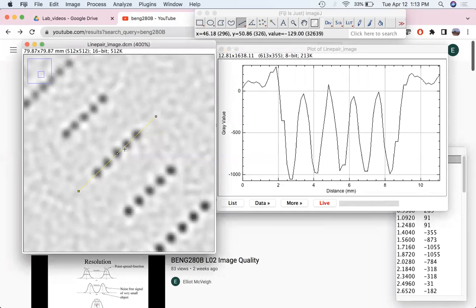This point here is this one, right? I've got 1, 2, 3. It should be the middle. It's this one actually, sorry. The dark spots. So I've got 5 dark spots. 1, 2, 3, 4, 5 here, and that's the middle one.